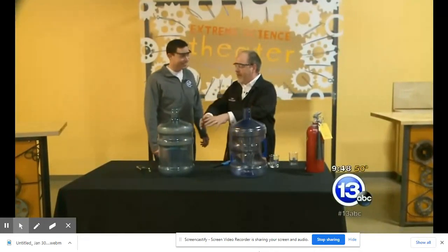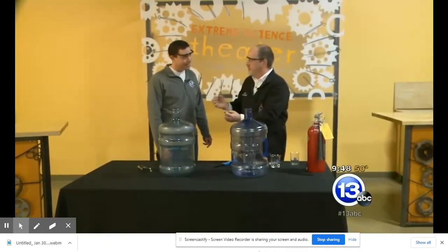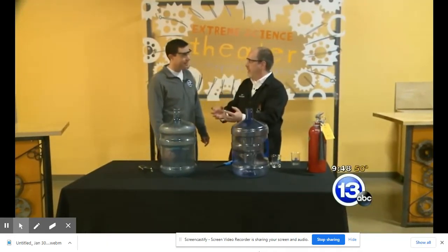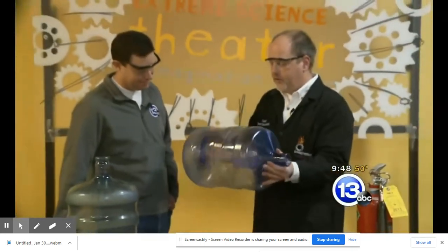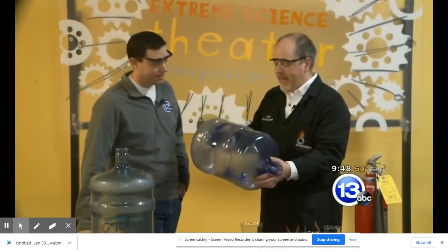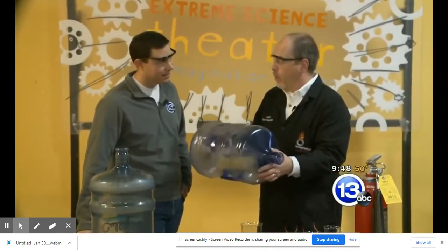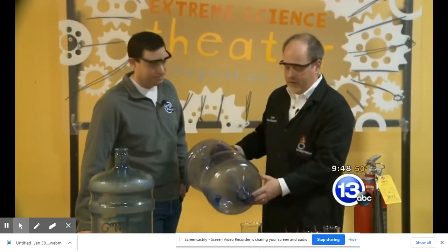And then the air expands and some of it gets pulled back in. And then there was a secondary sort of whoosh as it sort of oscillated back and forth. Now, the other thing that happened there that's kind of subtle, we're going to do it one more time, is that when the combustion happens, the gases inside warm up and they expand. And that's what caused that jet of flame to come shooting out.